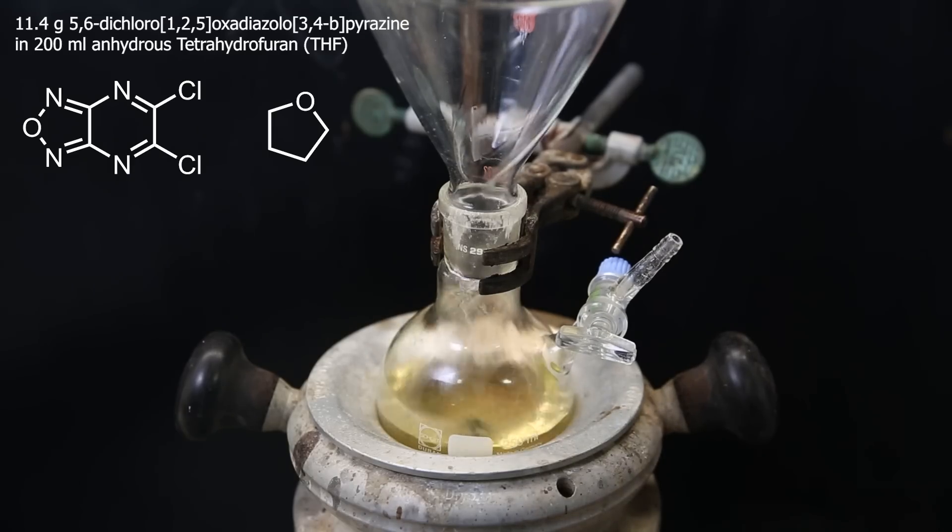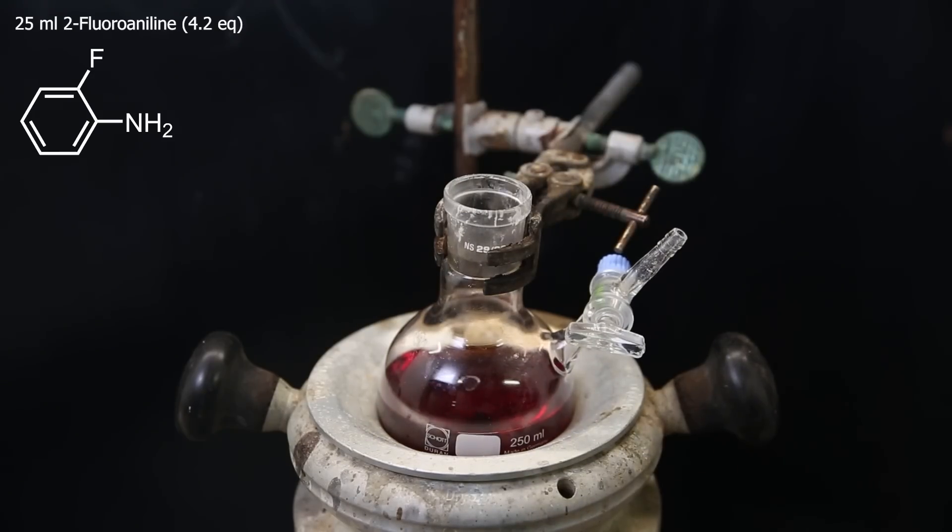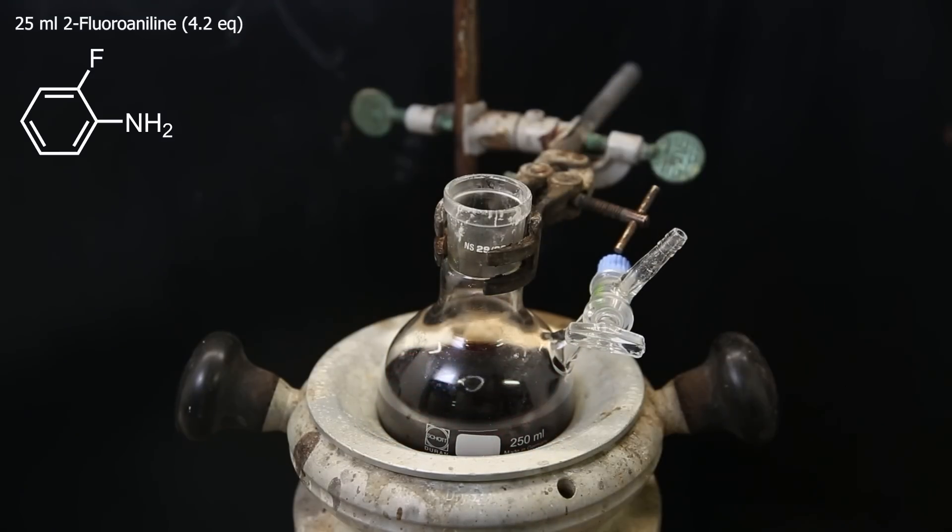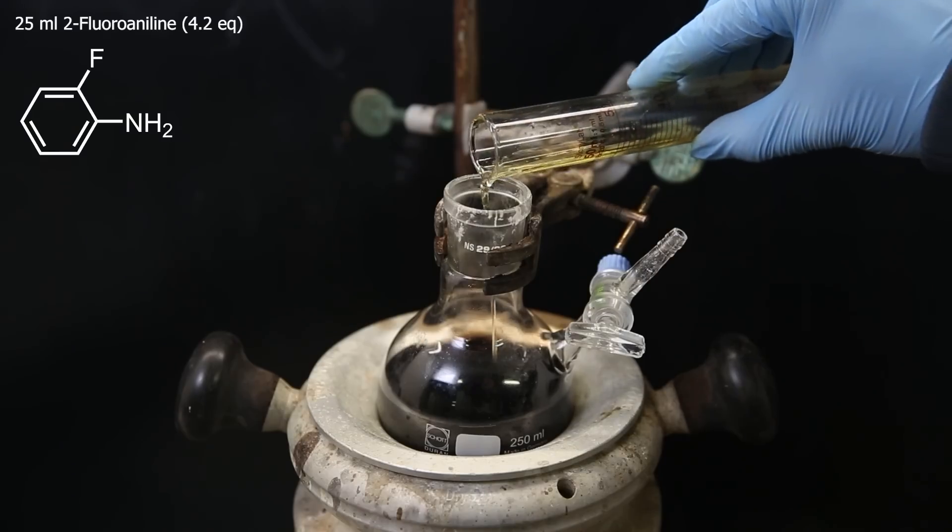So I dissolved all of the material in the solvent tetrahydrofuran and add it to the same flask I used for drying. Then the only reagent needed is 2-fluoroaniline, of which I add 25 mils. This is 4.2 equivalents, because in this reaction, it also serves as a base, plus a little bit extra to make sure it goes to completion.